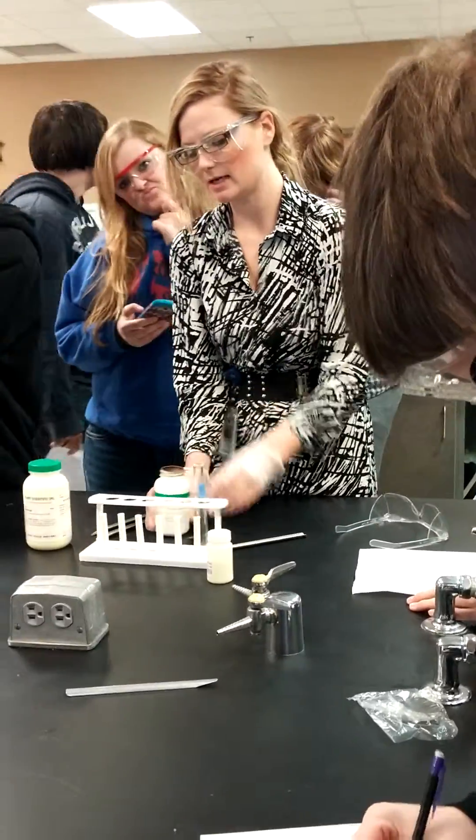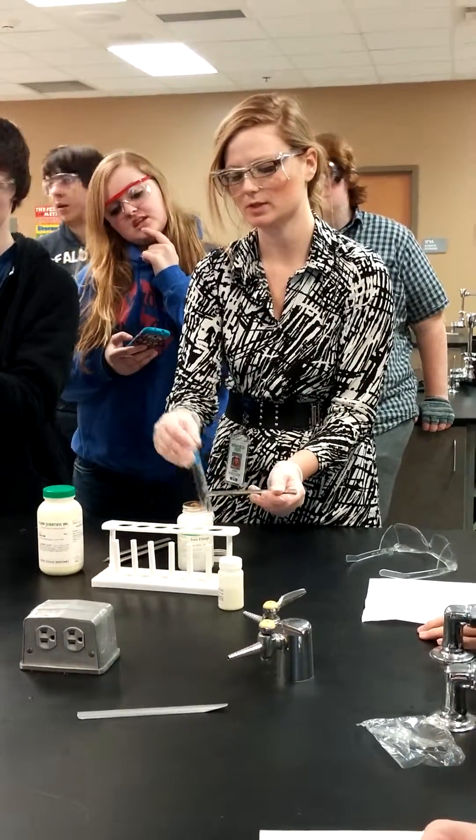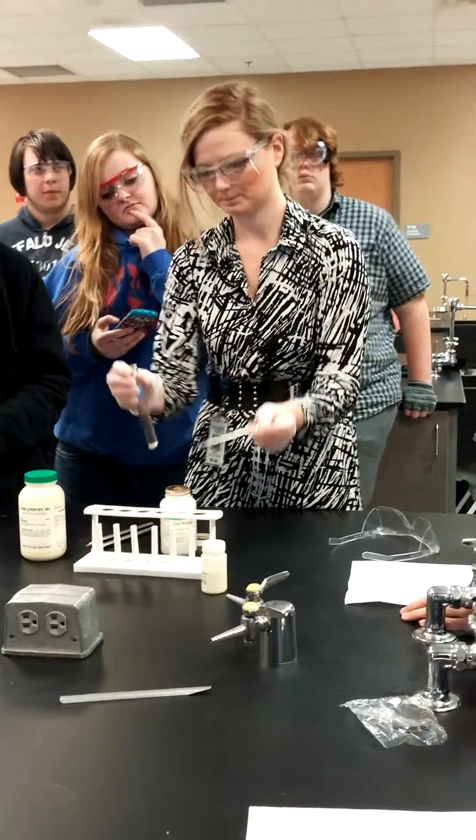So here's the iron filings. This is what you put in your copper sulfate solution — the blue solution in your test tube. That's solid, right? Yup.